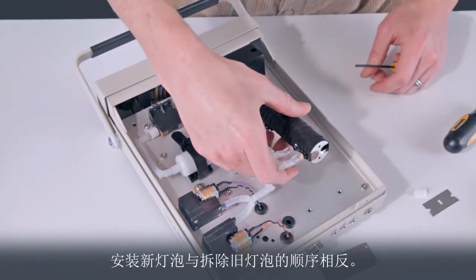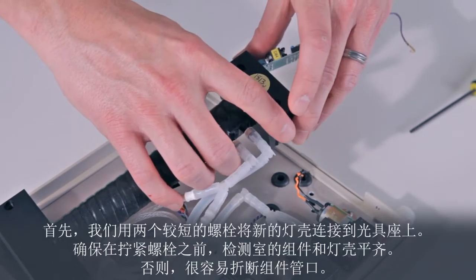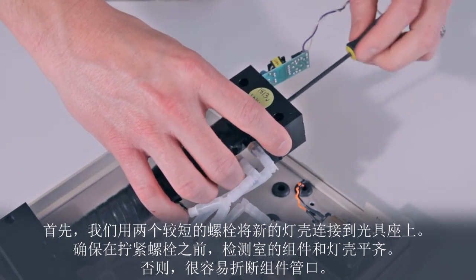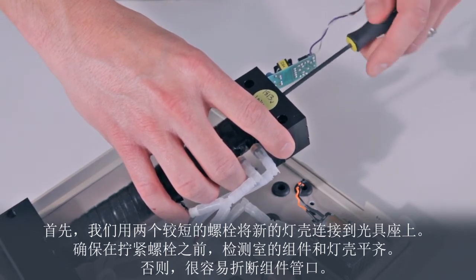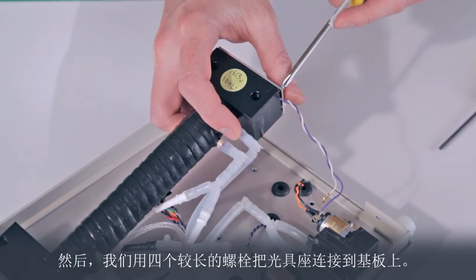We just reverse the process to install the new lamp. First, we attach the new lamp housing to the optical bench using two shorter bolts. Make sure the detection cell assembly is flush with the lamp housing before tightening the bolts. Otherwise, it is easy to snap off a cell window. Then attach the optical bench to the base plate using the four longer bolts.